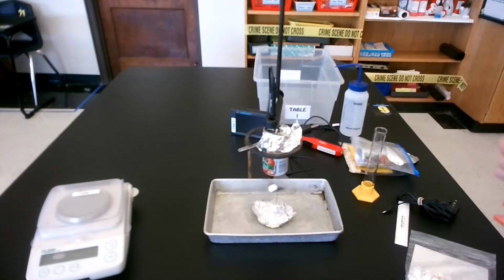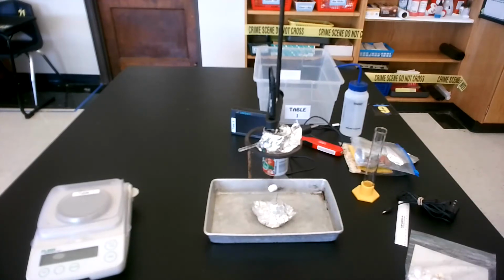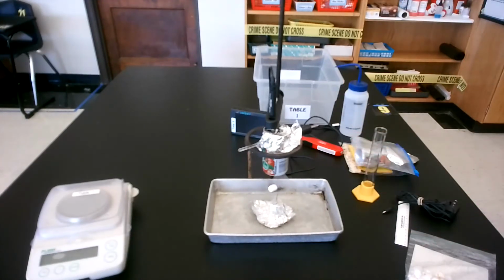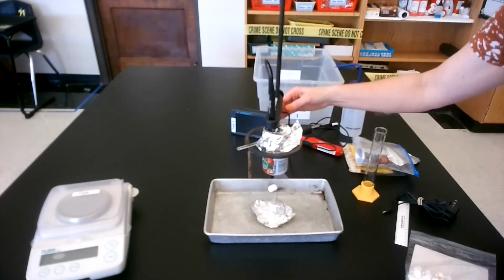Okay, so this entire setup is my calorimeter apparatus. Got the food holder apparatus, the calorimeter, because it's going to measure calories. It looks like calorie meter. That's what it looks like. So let me just make sure my cord is out of the way.